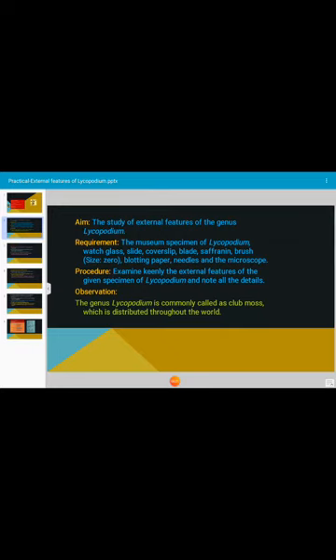The requirement for the practical is we need the museum specimen of Lycopodium, or if the material is available, then we can observe the material. We need slide, cover sleeve blade, saffranine brush, blotting paper, needle, and the microscope.